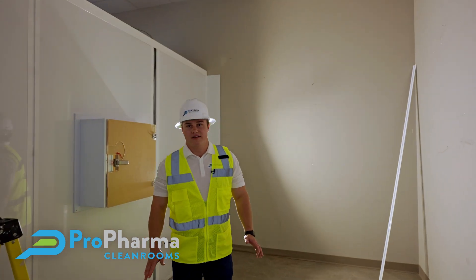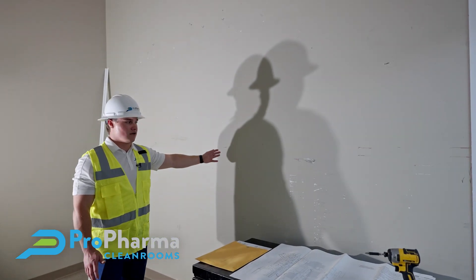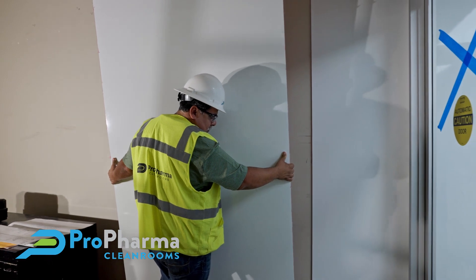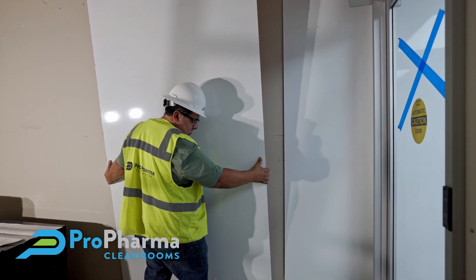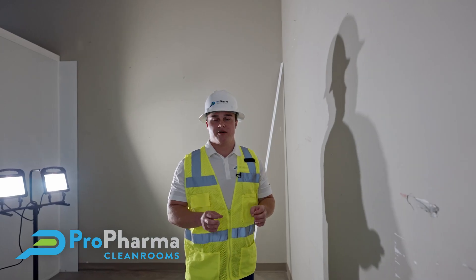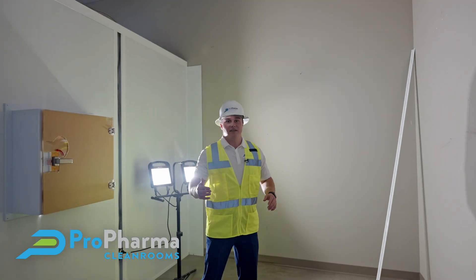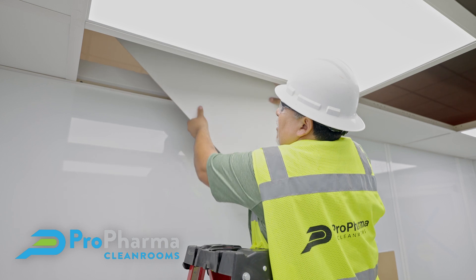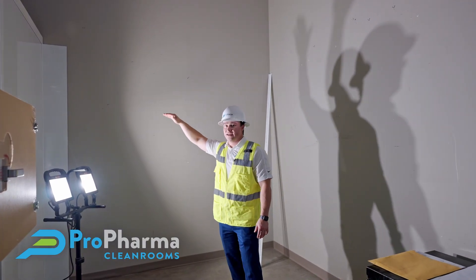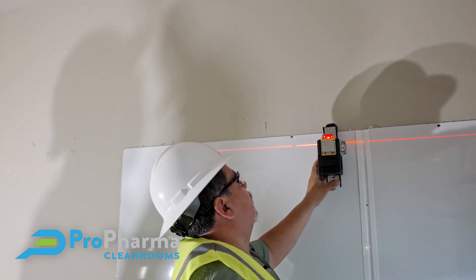In this room, we're currently in phase one of construction. We're facing a gyp board wall here — this is existing structure. We're going to come in and the room is basically going to be a white box. We're going to take our quarter-inch honeycomb aluminum panel with baked enamel finish and glue it onto this wall, then attach it in the middle with a strip and seal both sides with 100% silicone to meet USP standards. Above me, when this phase is complete, duct work and electrical rough-ins will be done by the general contractor, and we're going to install our ceiling grid at 7 foot 10 inches high to minimize the cleanable air volume.